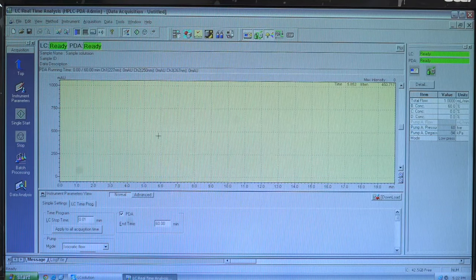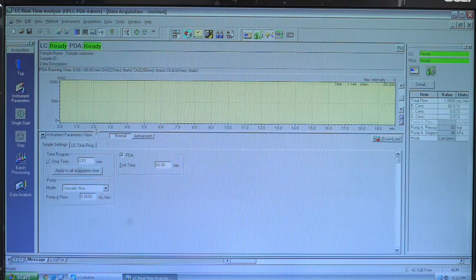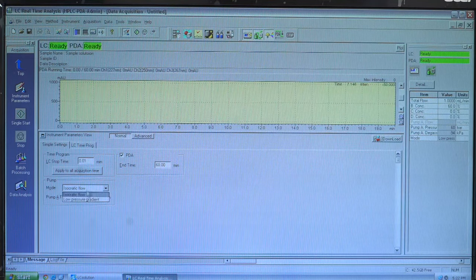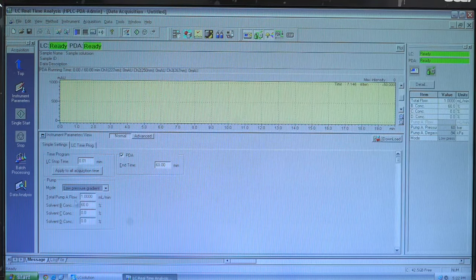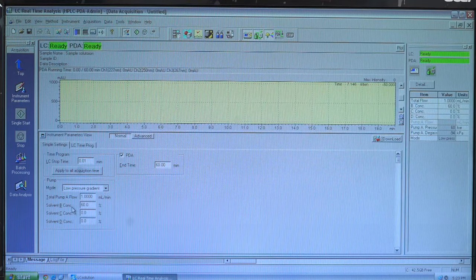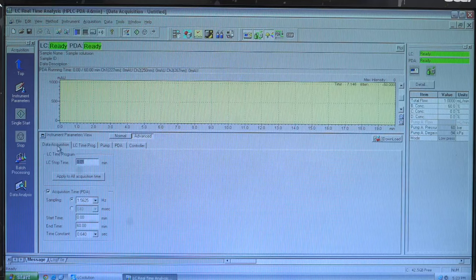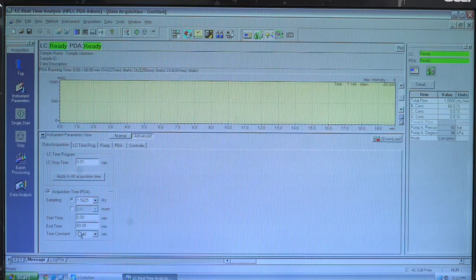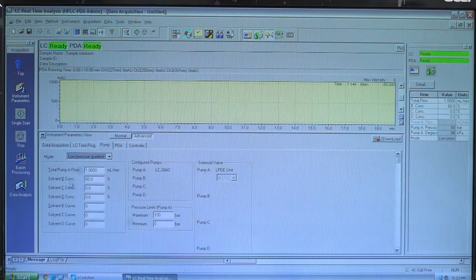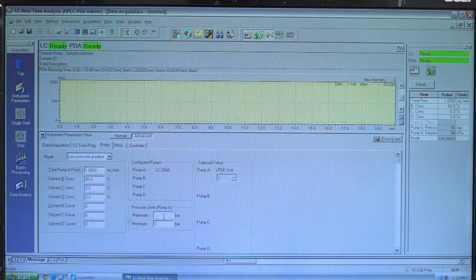Now we will create a new method file. For inputs in the new method file, we will use the instrument parameter view, which has two tabs: normal and advanced. In the normal tab, we will select the pump mode as low pressure gradient, set the pump flow rate as 1 ml per minute, and give the concentration of solvent B as 60%, which will automatically set solvent A to 40%. In the advanced settings under data acquisition, we will set the total run time from 0 to 10 minutes. In the pump settings, we will give the pressure limit as maximum up to 350 bar.